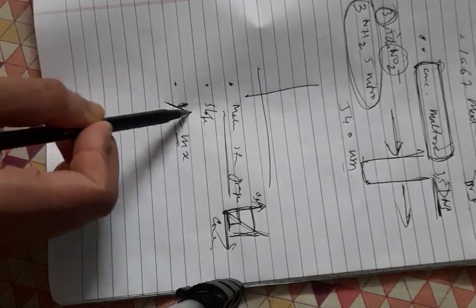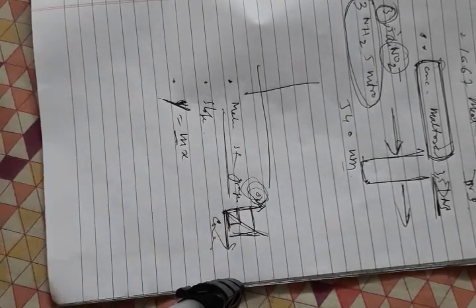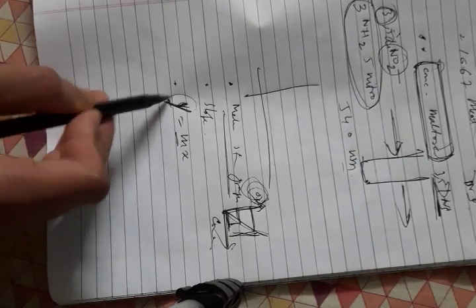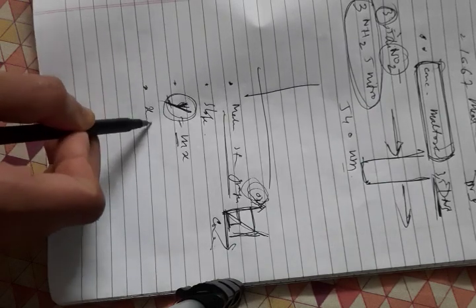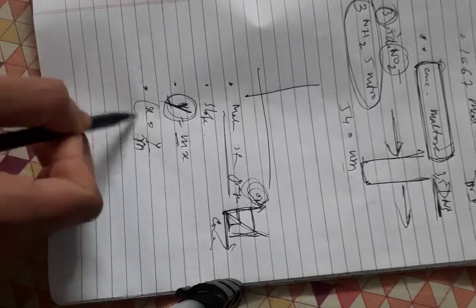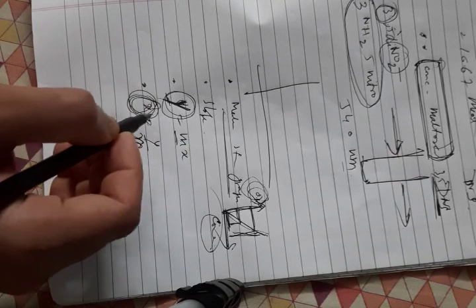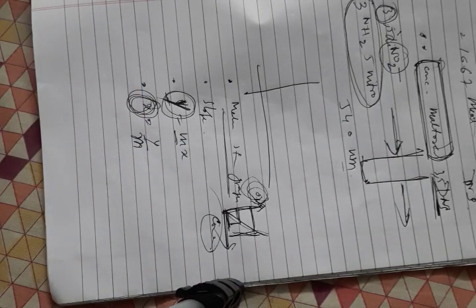We have got y when we find the OD for the unknown concentration. So on dividing this OD by m, the slope, we can find out the unknown concentration of maltose, right?